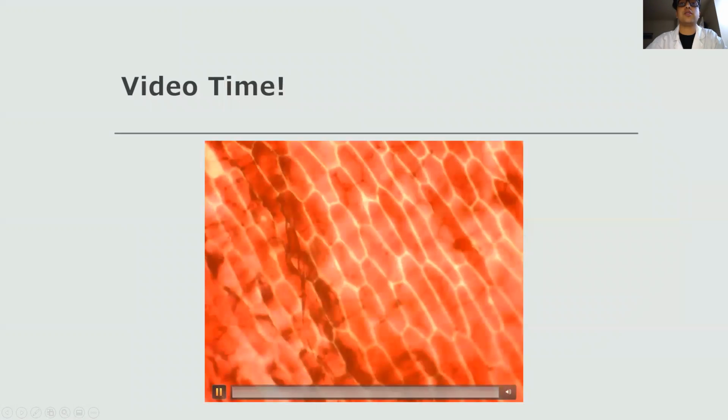So here, as you can see, the cells are normal in size. You can see what's called a cell wall here. And you can see the inside and the outside, and the onion cells are normal in size, nothing too crazy. This is called isotonic, which we'll talk about more later on. But there's essentially no net flow of water. There's no movement of water from either inside the cell or outside the cell. It's just, in a sense, at an equilibrium. There you go. Some university students can pronounce that.